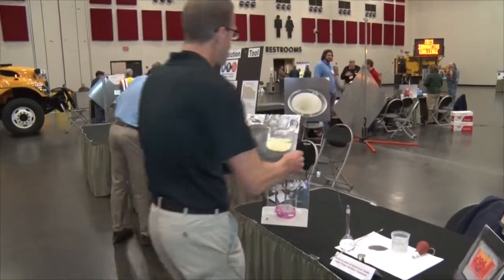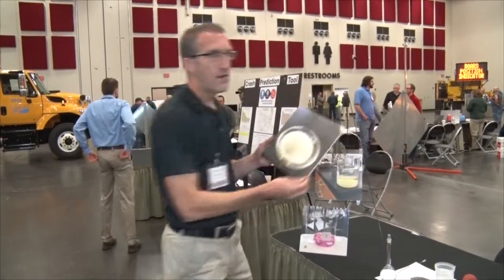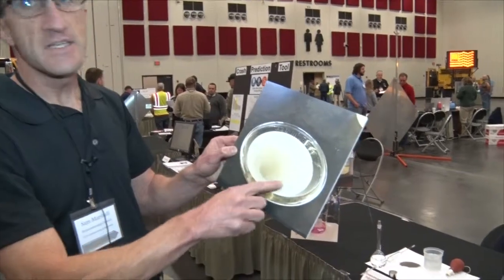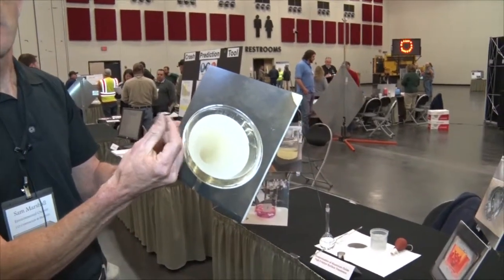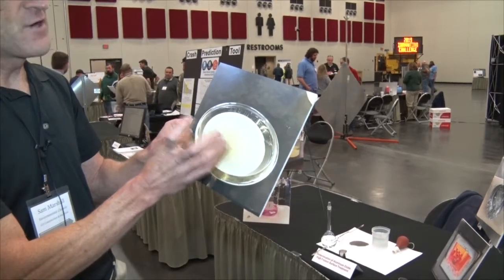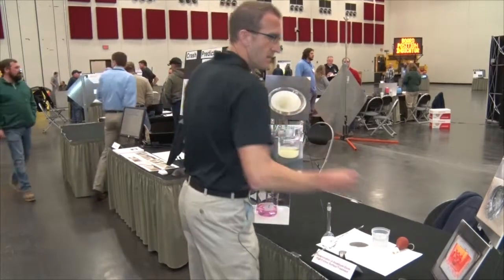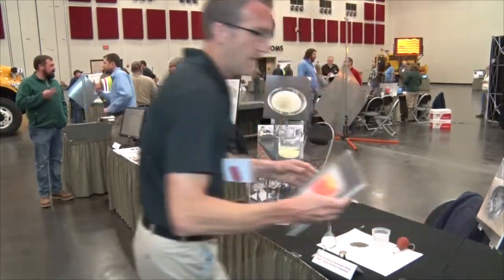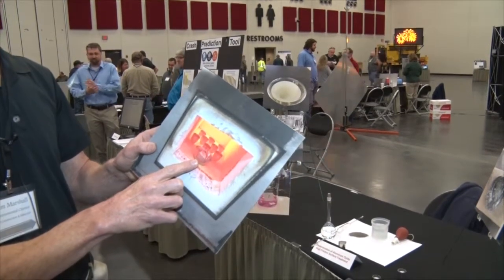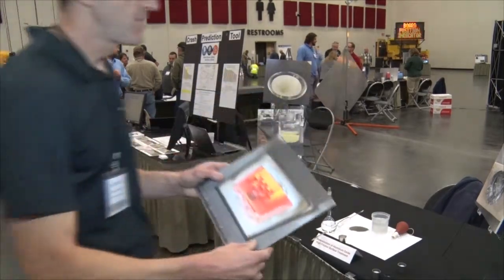From there, I'll filter it, isolate it. As you can tell, it's a hydroxide, so it looks a little bit like jelly. Once I've filtered all that out, I will transfer that filter paper to a platinum crucible, and I'll ignite it in a muffle furnace, 1,000 degrees C. As you can tell, it's pretty hot.